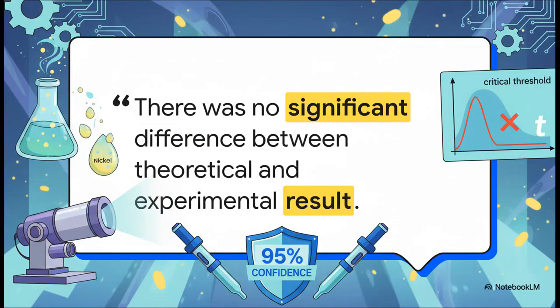And a student t-test mathematically seals the deal on this research. When comparing the instrument's calculated values directly against the known manually spiked amounts, the experimental t-values generated were sitting well below the critical statistical threshold. This definitively confirms that these rapid, non-destructive extraction methodologies are just as incredibly accurate and reliable as the agonizingly slow, hazardous, traditional digestions of the past. This isn't just a close estimate, folks. It is statistically indistinguishable from absolute perfection at a 95% confidence interval.